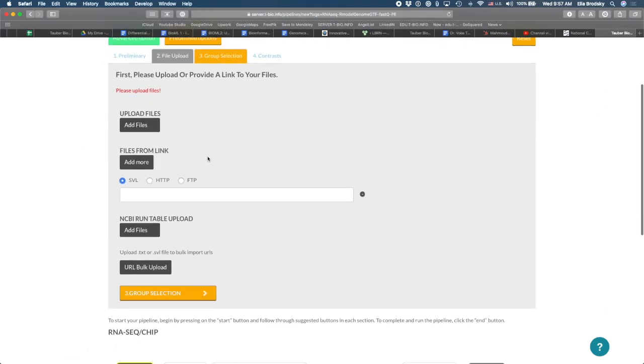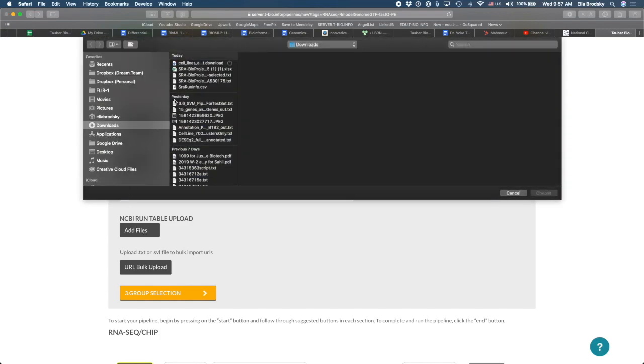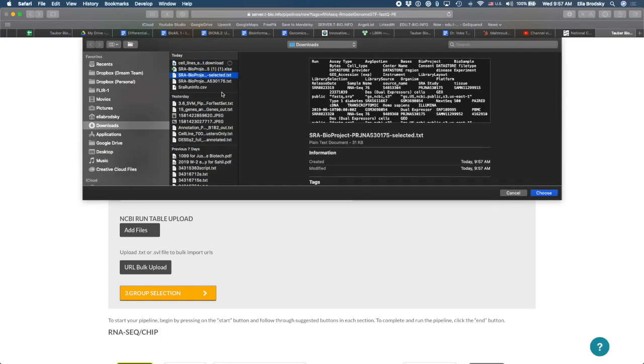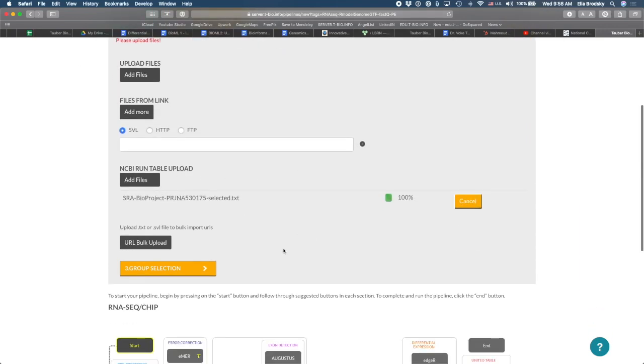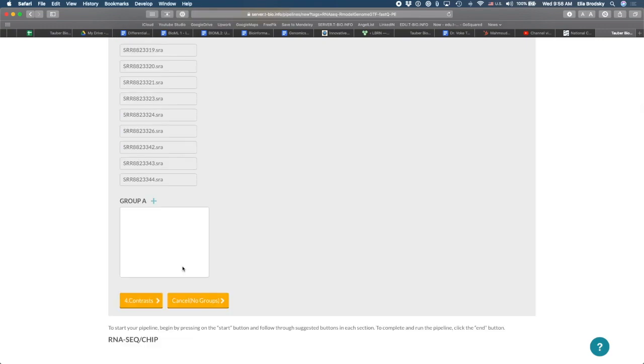Now, I'm going to go back here, and here you can see NCBI run table upload. So I'm going to add files. And here I have this file that I just prepared, selected. Go to choose. You can see that it uploads and shows you 100%. And now I can go to group selection.